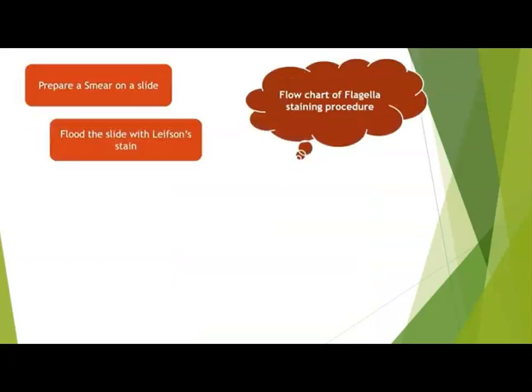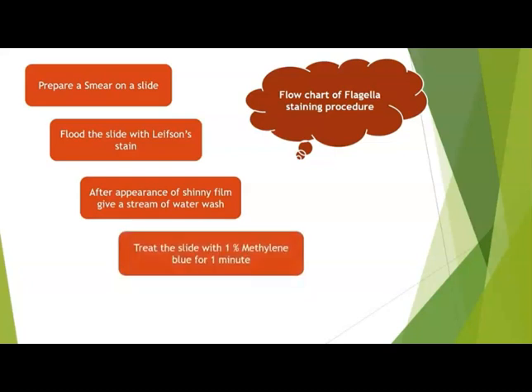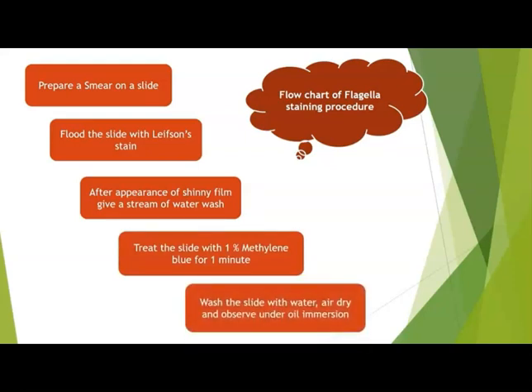Flood the slide with Lifson stain and air dry the slide. After appearance of a shiny film, give a stream of water wash treatment to the slide. Treat the slide with 1% methylene blue for 1 minute. After that, wash the slide with water, air dry and observe under oil immersion.